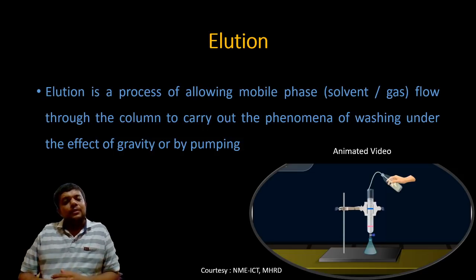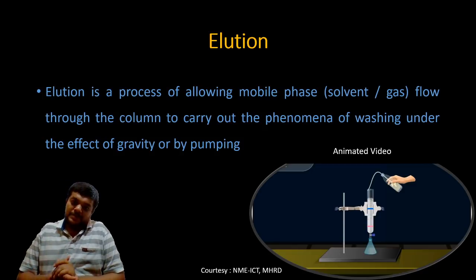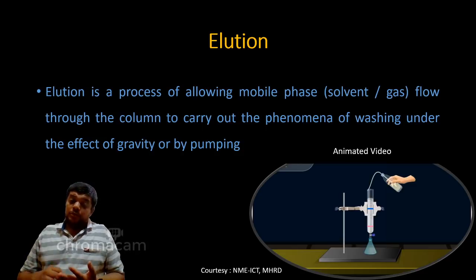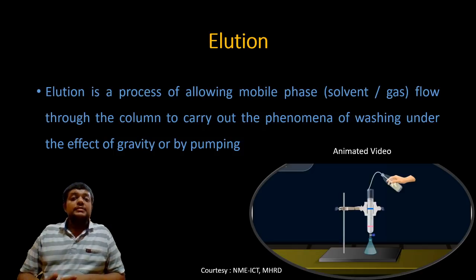Few of you, after listening to the video, might think that there is much more to say about stationary phase and mobile phase, but friends, I had to divide the theory related to stationary phase and mobile phase into 9 different lectures, because every time I had ample opportunity to say more. So when you have all the 9 lectures in your mind at the end of the course, you will have a heap full of knowledge on stationary phase and on mobile phase alone. But the main motive of this lecture was to show you the classification: how wonderfully it is classified based on the shape, the separation mechanism, and the forces of attraction. So this is how chromatography, a very interesting topic, can be explained on the basis of its classification.